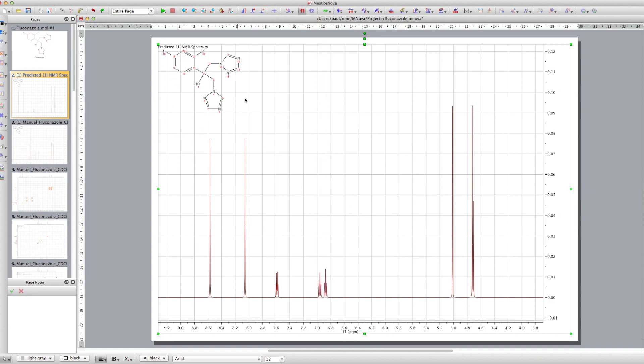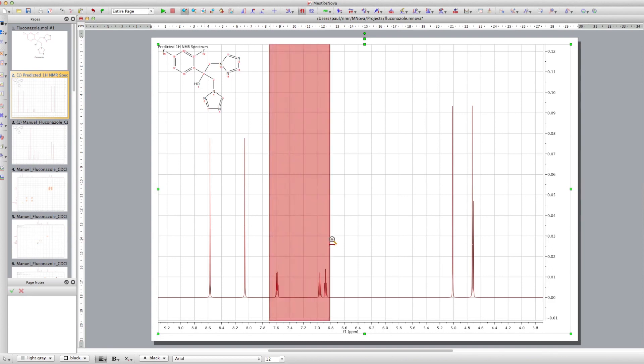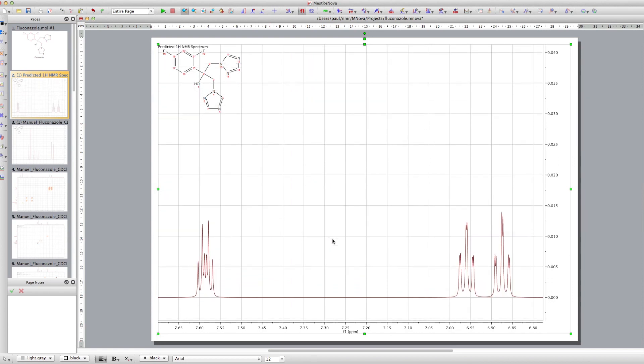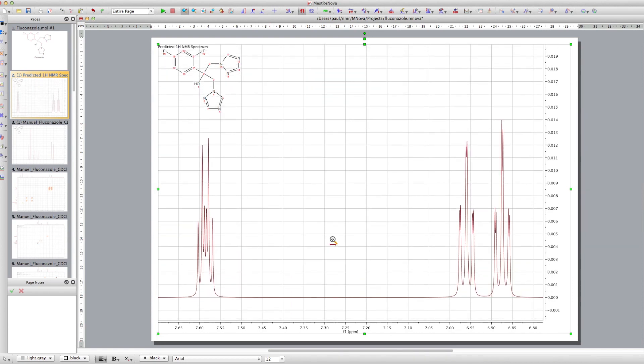And if we zoom in on these signals, we'll see some very interesting splitting patterns. So we'll just do that right now.